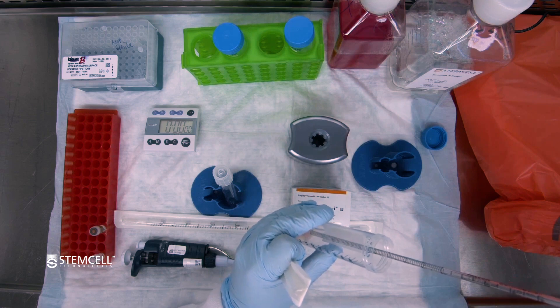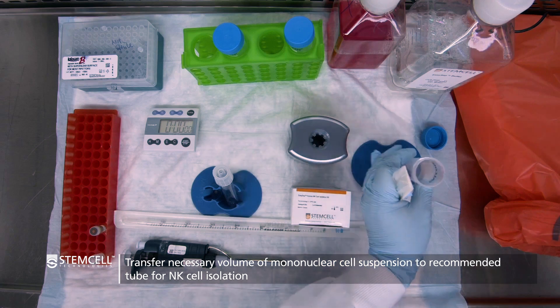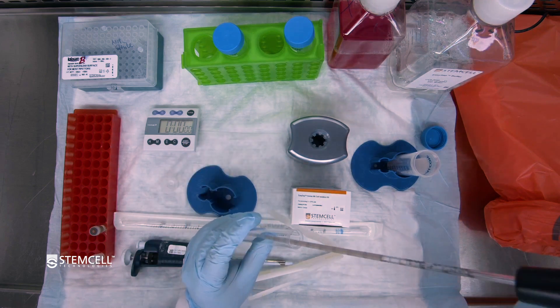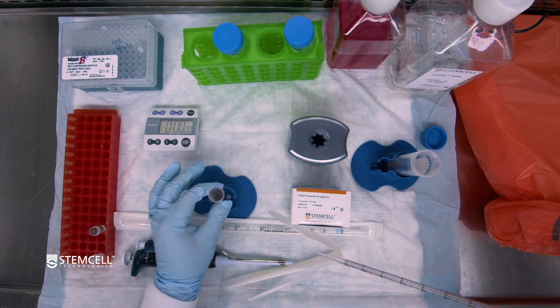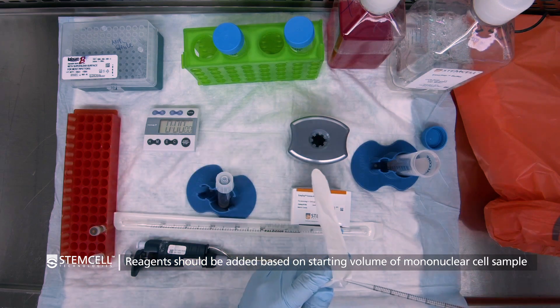So now we're going to transfer that 1 ml into our 14 ml round bottom tube, which is compatible with the silver BigEasy magnet. Always take good note of exactly how much volume you're dispensing, since that value will be used for all the subsequent reagent addition calculations.